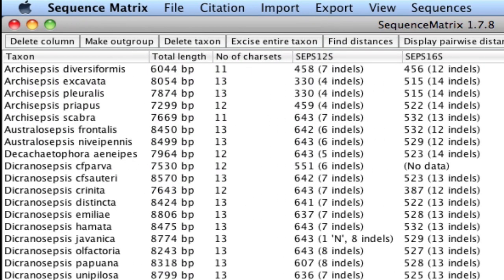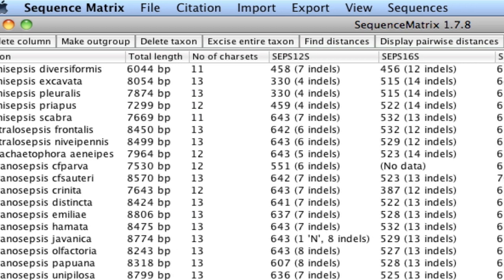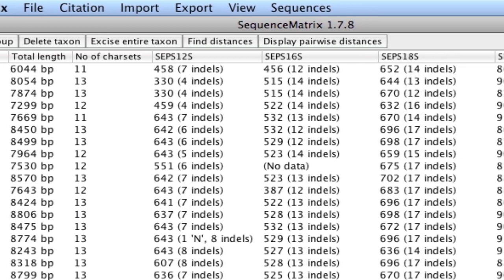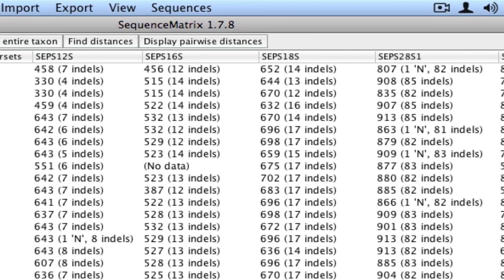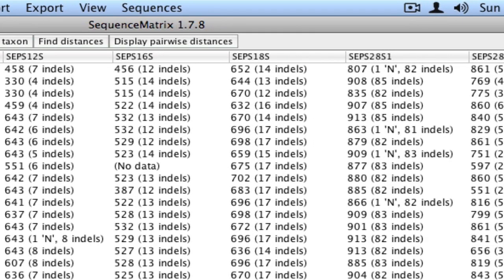For every taxon, Sequence Matrix provides the total number of base pairs and the total number of character sets. For each individual sequence, the program displays the number of base pairs, the number of base pairs coded as N, and the number of indels.